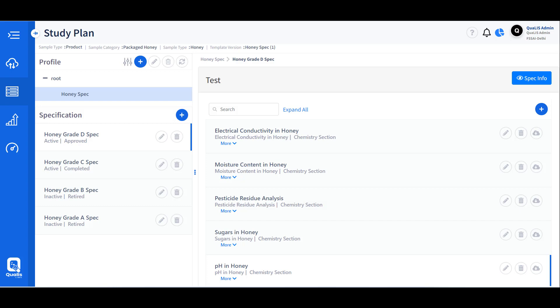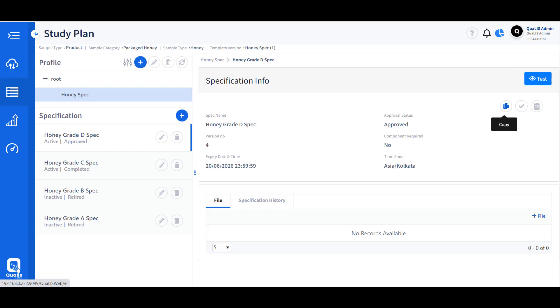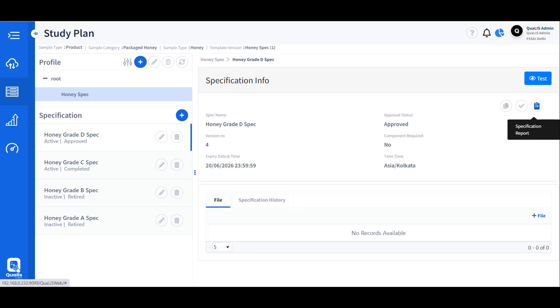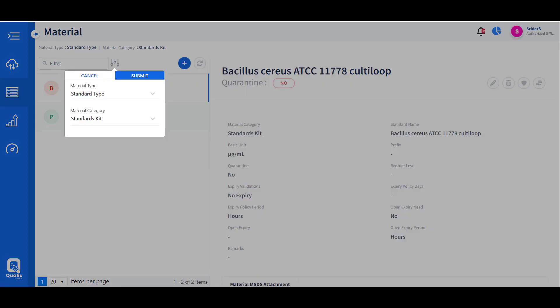A product can have multiple specifications based on grade or other requirements, so multi-level specifications for each product can be defined, reviewed, and approved. While defining the product specification, the tests needed and specification limits for each parameter are associated. The appropriate calculation method can be chosen based on the specific requirement of the product, and then specifications are reviewed and approved.